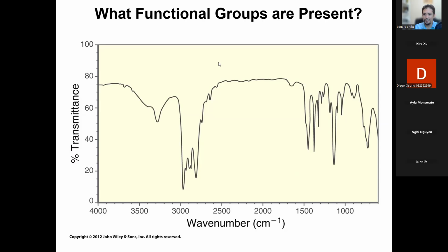What is this one right here? Is it another amine? It is. What type? The secondary? It's secondary now, right? Exactly. So once again, look at the region. Remember, we look for wave numbers, we look for shape, and we look for intensity. So here, the wave numbers are still the same, 3200 to 3500, roughly.